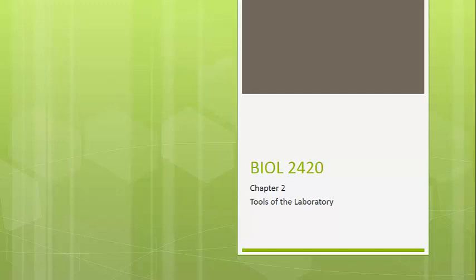So no introduction to the field of microbiology would be complete without talking about some of the tools of the laboratory, which is covered in Chapter 2. So we're going to talk about some of the tools that you'll be working with in lab this semester to help you better understand microbiology.